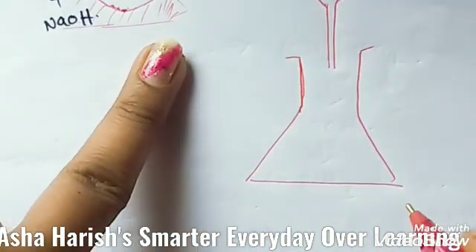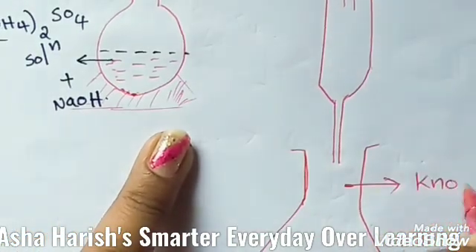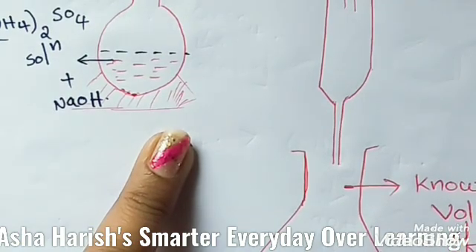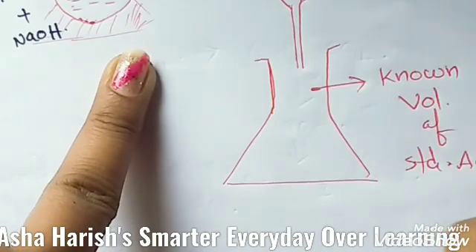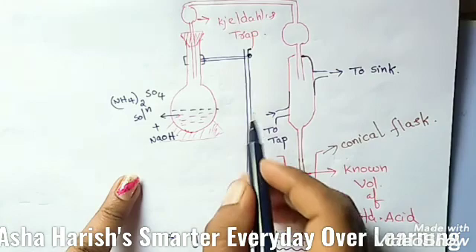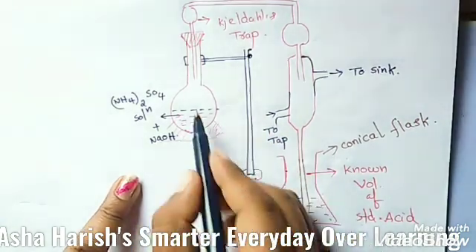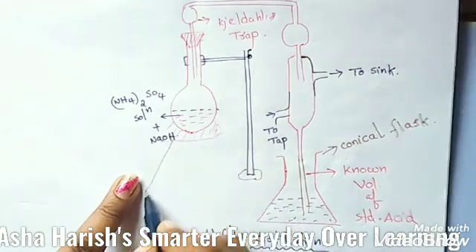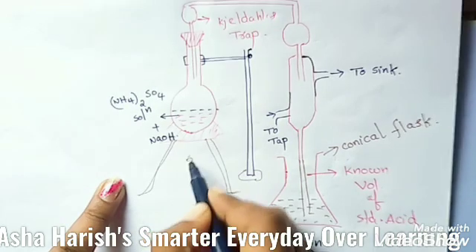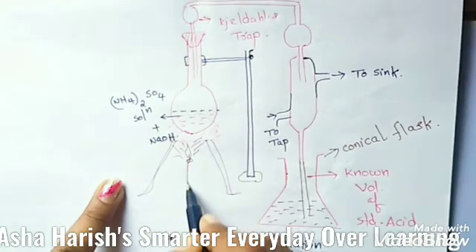One conical flask you need to take here, with a known volume of standard acid. This flask is connected to a stand just for fixation, and with the help of wire gauze and tripod stand, we have to heat it gently with a Bunsen burner.